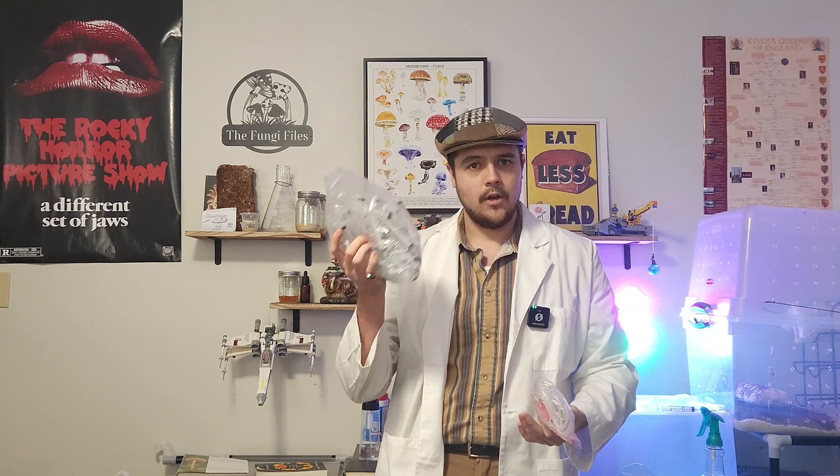Let's start by taking a look at the liquid culture items that I got. I got this 50-pack of syringes for nine dollars — I've used a few of them so far but these will last me quite a while. I also got these syringe caps for three dollars and 114 inches of surgical tubing for about four dollars. I'll be using the surgical tubing for liquid culture jars so I can use needleless injection to keep everything entirely sterile with no introduction of an outdoor needle.